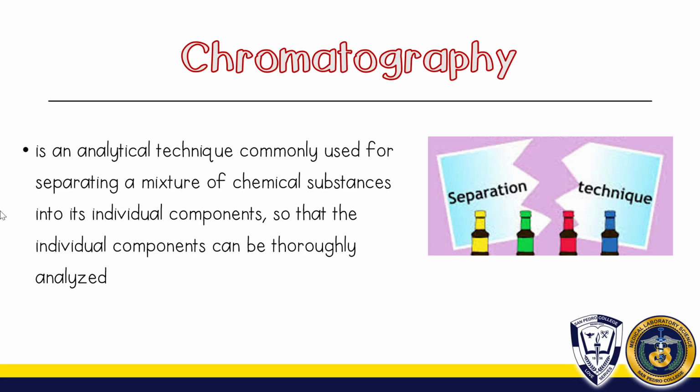Now, you might wonder, ma'am, the word itself depicts color, di ba? Kaya chrome or chroma means color. Because if you try to go back to history, the very first person who discovered it, I forgot the name, basta katong pinaka-first na buhat aning chromatography, ang separation man gud na iyang ginabuhat is with the use of pigments. And syempre, pigments have colors, thus na-coin the word chromatography.